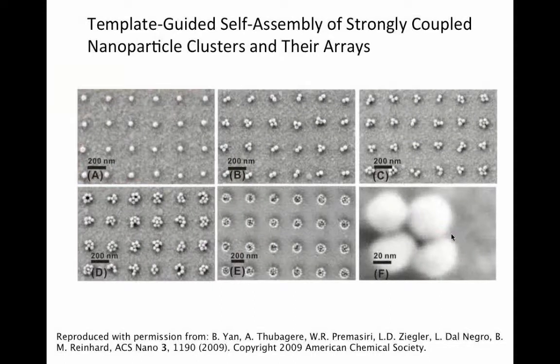With this approach, we can now control nanoparticle cluster sizes at defined locations. This is illustrated here in this SEM micrograph. So by changing the diameter of the binding site created by the e-beam in your pattern, you can now create individual particles or smaller clusters or larger clusters.